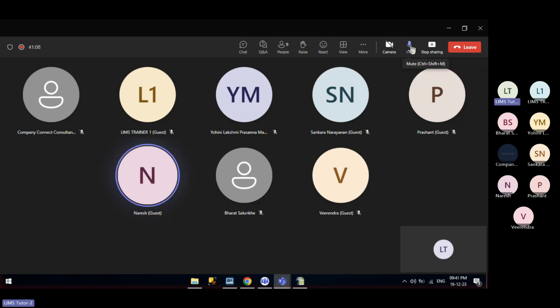Another question: in the instrument interface, we are going to deal with the port-based and file-based as well as CDS. Which is the third one you are saying? Like chromatography, HPLC, GC instruments, CDS, Empower. We are not going to cover the CDS part, only file-based, because in my current organization they also generate the report in the form of PDF, and then this PDF itself is transferred to LabWare LIMS. So there is no direct integration with any CDS system.